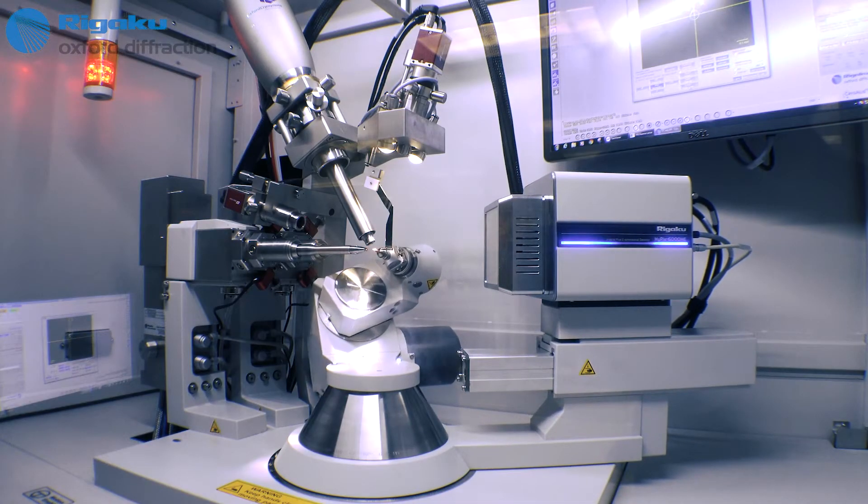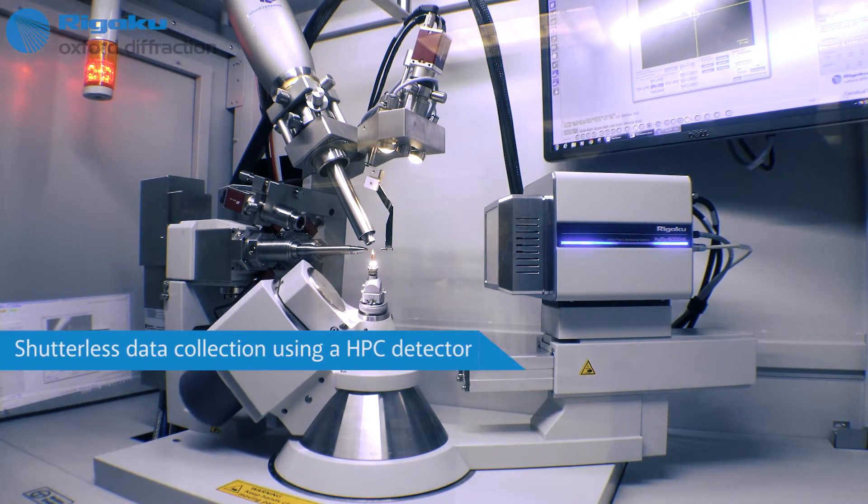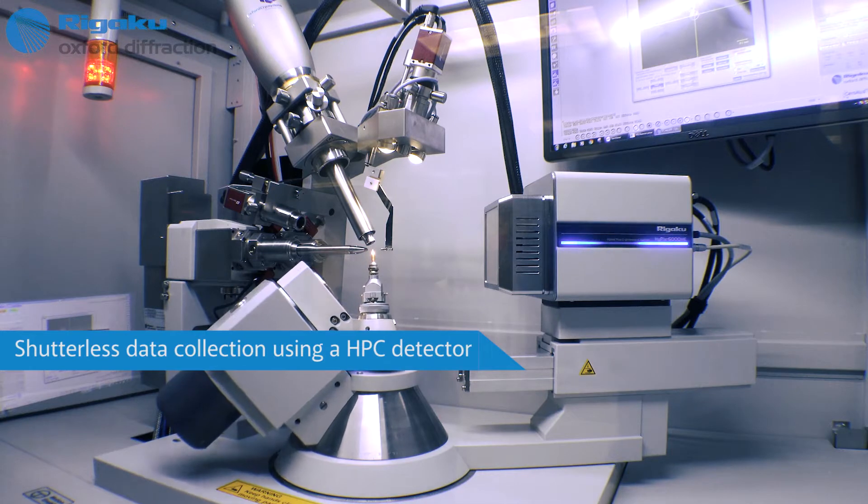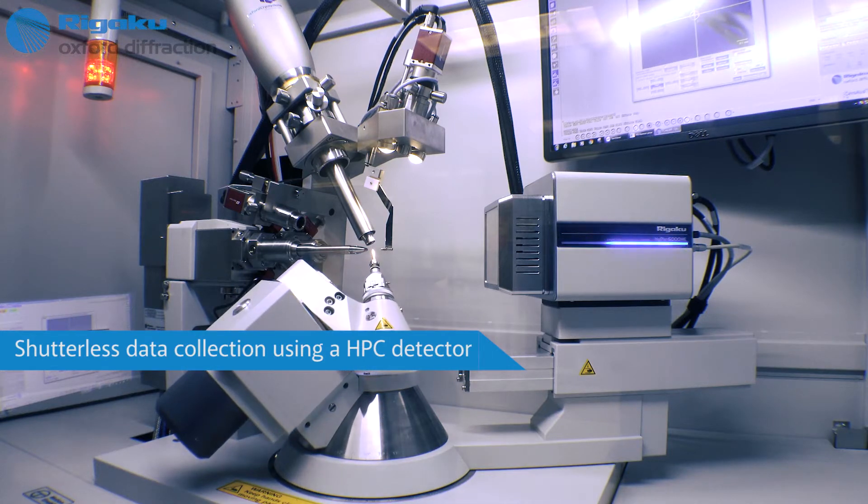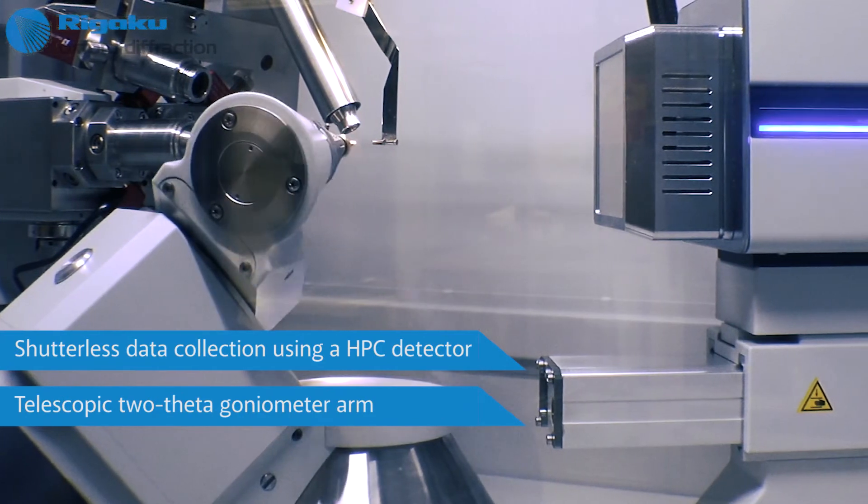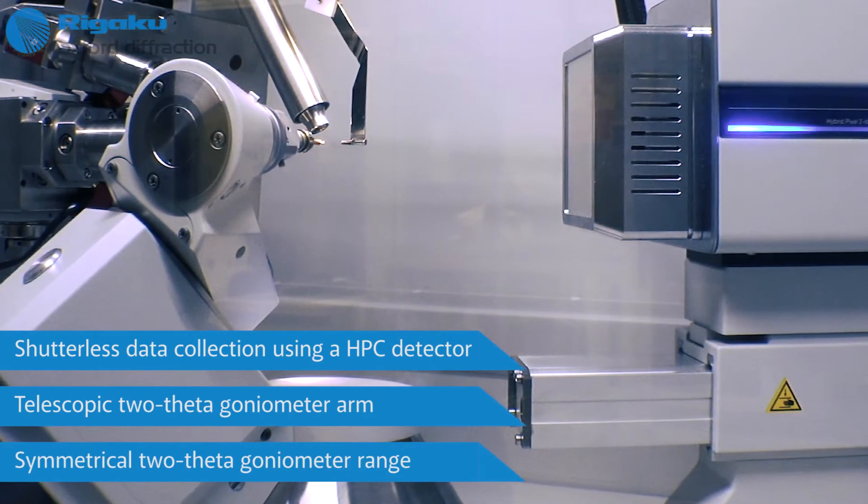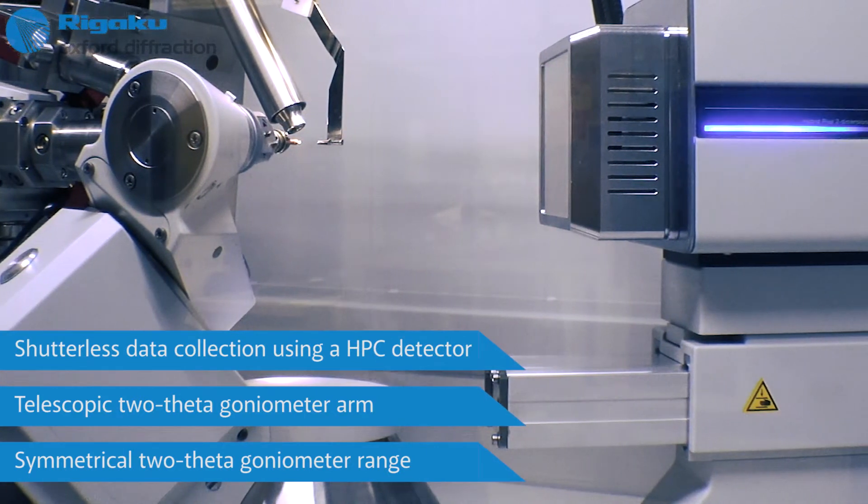Moving faster than ever, the new Precision Kappa Goniometer makes the most of shutterless data collections when using hybrid photon counting or HPC detectors. The telescopic theta arm provides a large distance range and a symmetrical theta range, so you can position your detector to suit your sample type.